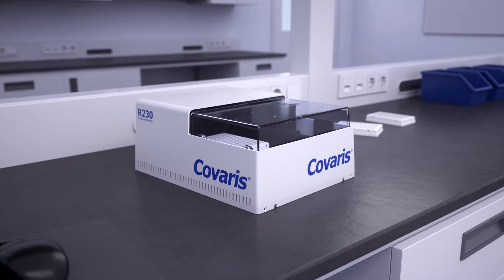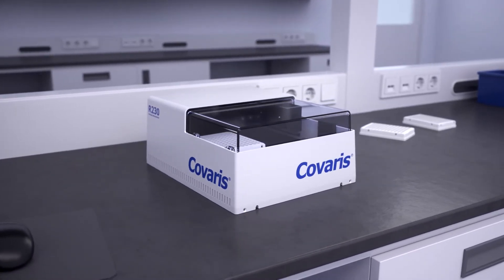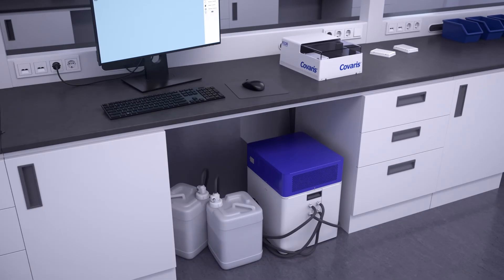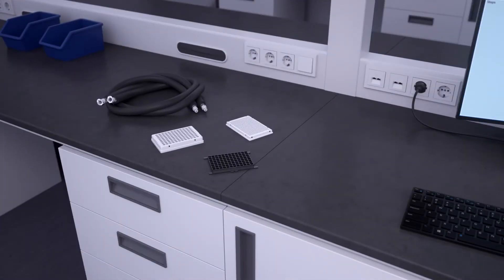The R230 is comprised of the small on-bench or on-deck unit where samples are processed, an electronics box and water conditioning system which can be remotely located, Sonolab software, and the necessary accessories.